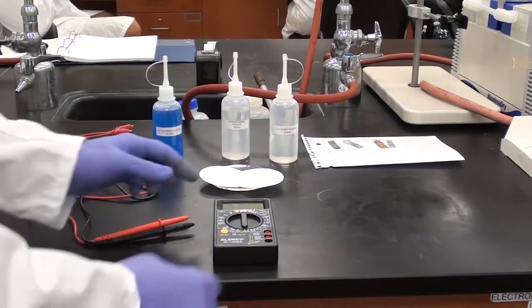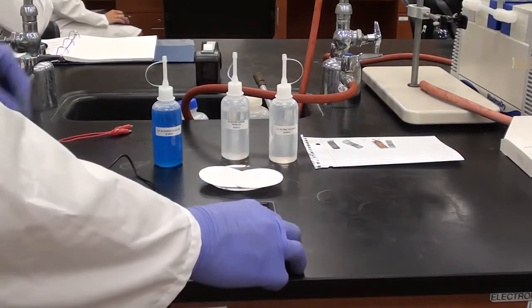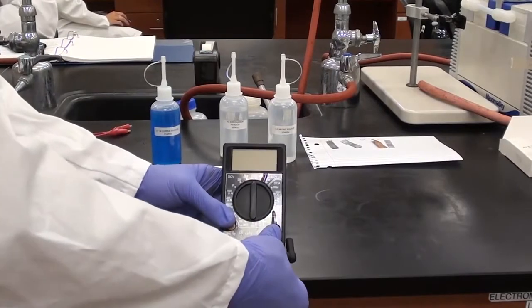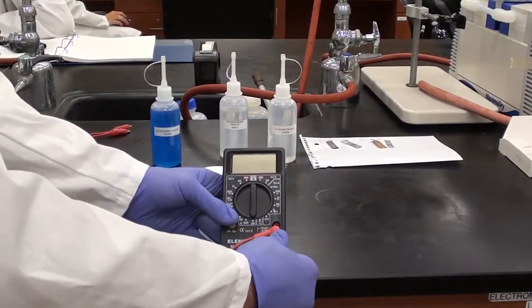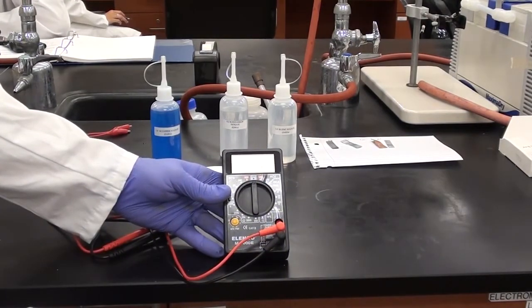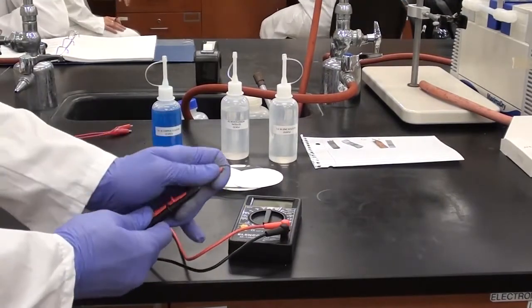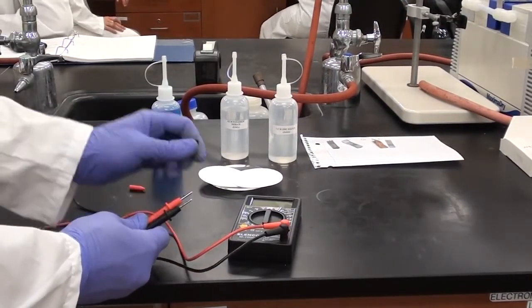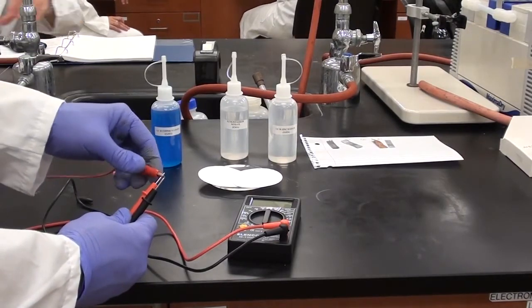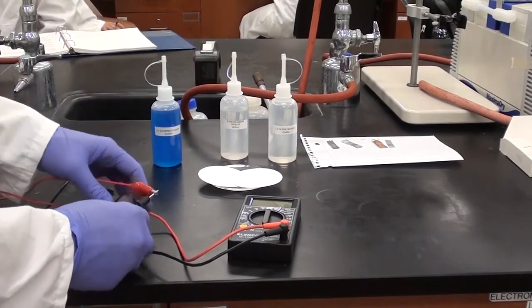So here we have a multimeter, and what Sam's going to do now is plug the electrodes into that multimeter. He's going to plug the red one into the middle one there, which is the positive, and the black one into the negative, which is down the bottom. Now he's going to take the other ends and remove the caps of these electrodes. And now he's going to attach alligator clips to each. The colour of the alligator clips doesn't really matter. There we go, one to each.